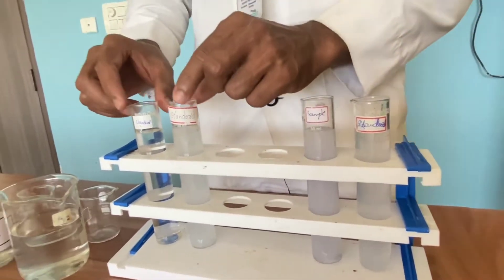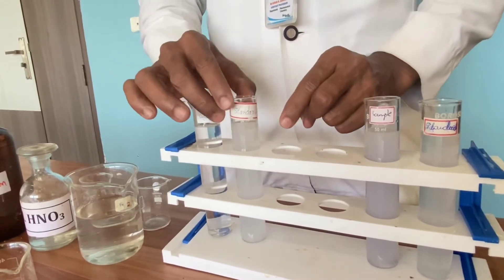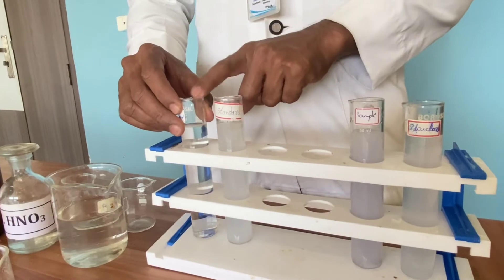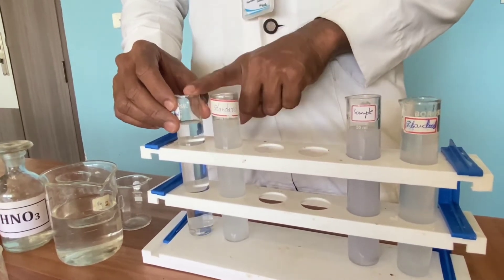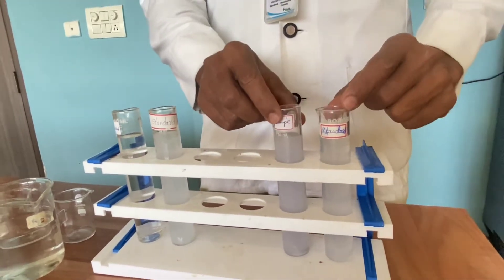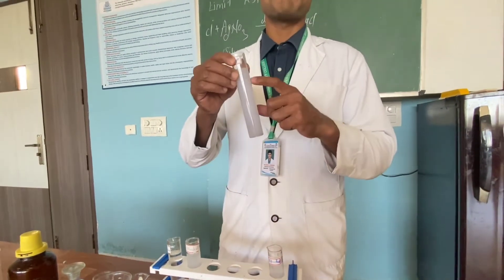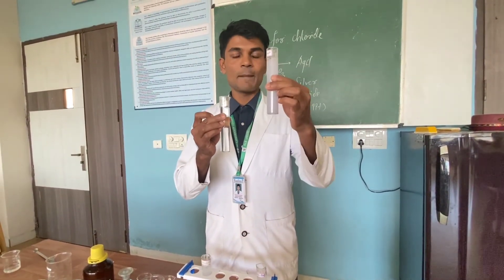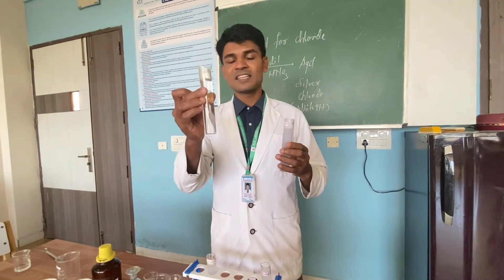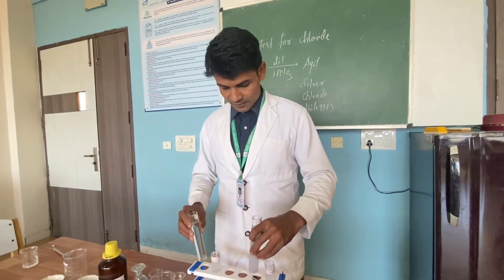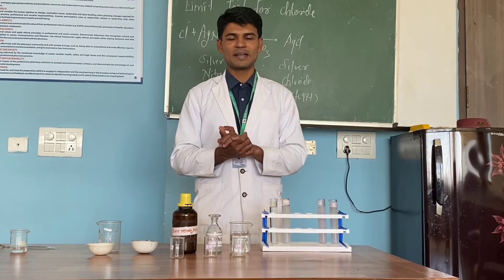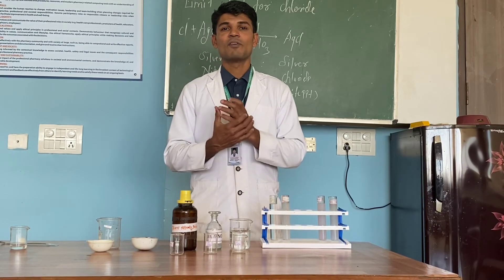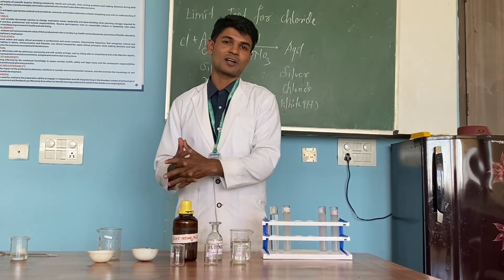Now if you look at this: this is the sample solution and this is the standard solution. In this case, the turbidity in the standard solution is more than the sample. So it represents the content of Chloride ion in one sample solution is more, and the content of Chloride ion in the other sample solution is less as compared to the standard. This sample does not pass the limit test for Chloride, and this sample passes the limit test for Chloride. This is how we perform the limit test for Chloride, and by performing it we can identify whether Chloride impurity is present in that particular compound or not. Thank you.